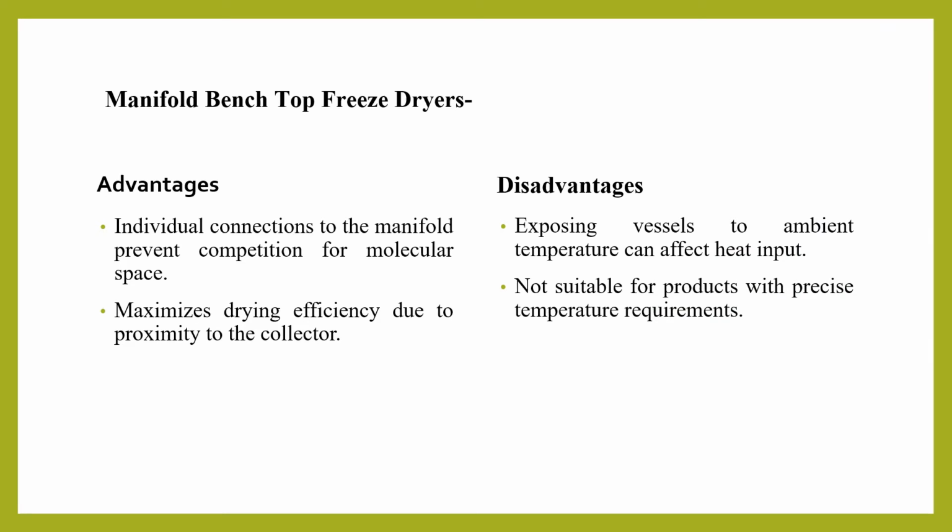Some advantages of manifold benchtop freeze dryer: individual connection to the manifold prevents competition for molecular space. It also maximizes drying efficiency due to proximity to the collector. Disadvantages are that exposing vessels to ambient temperature can affect heat input, and it is not suitable for products with precise temperature requirements.